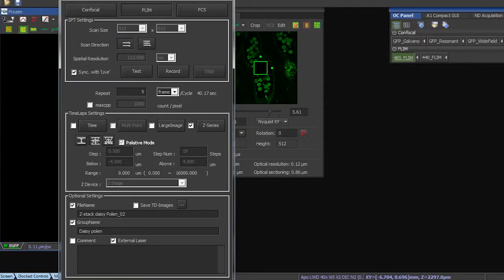One of the nicest things of this macro plugin software is that it allowed us to make z-stacks in a very convenient way.